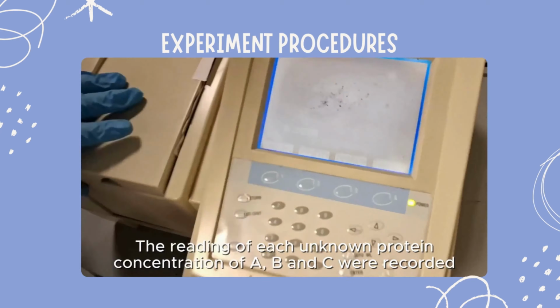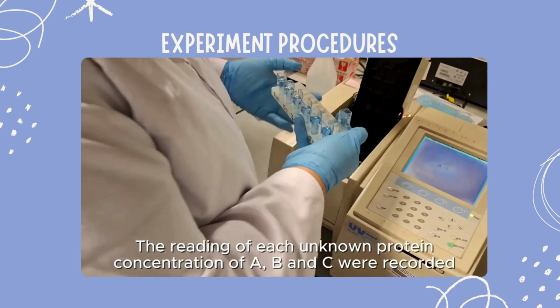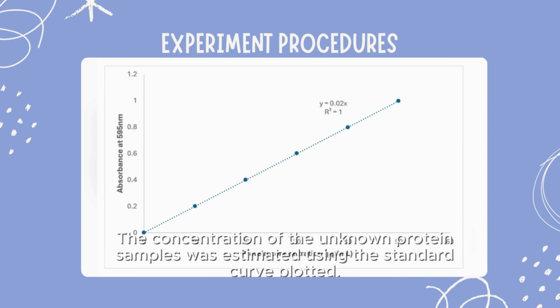The reading of each unknown protein concentration of A, B, and C was recorded. The concentration of the unknown protein samples was estimated using the standard curve plot.